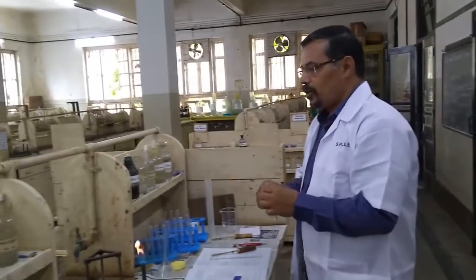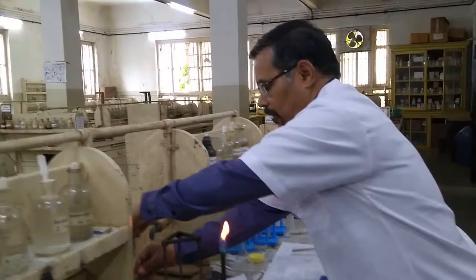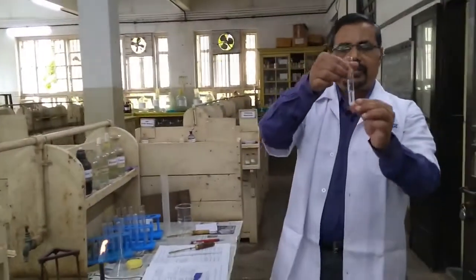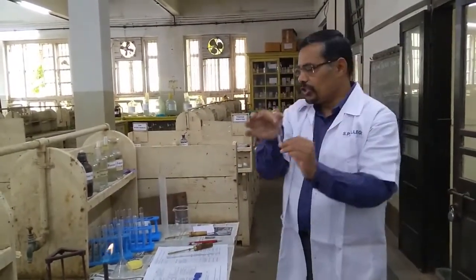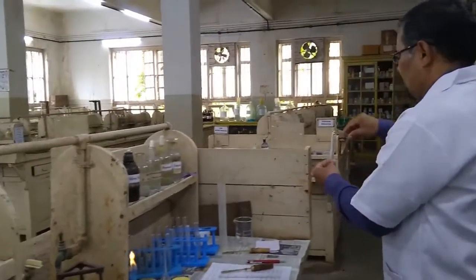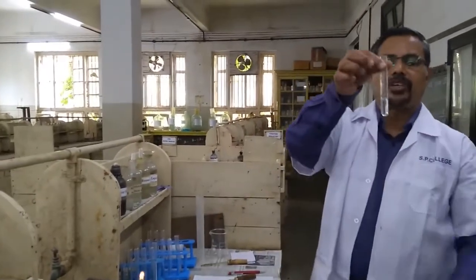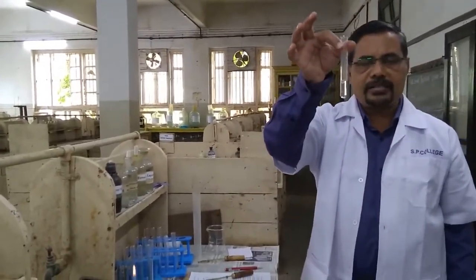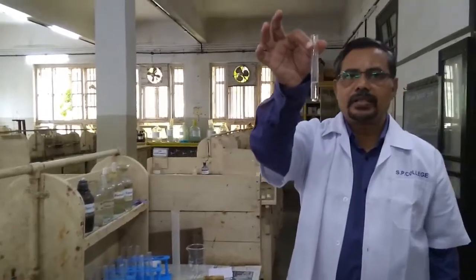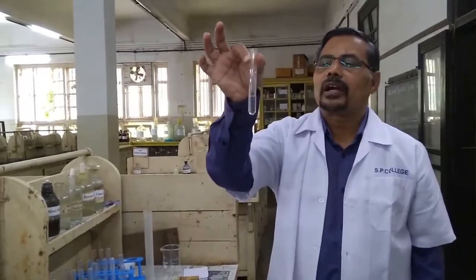So the small quantity of given mixture contains distilled water, and this solution is the original solution. So this is the original solution prepared for the given mixture. For the further tests, we will use this original solution. So the original solution is a solution of the given mixture and distilled water.